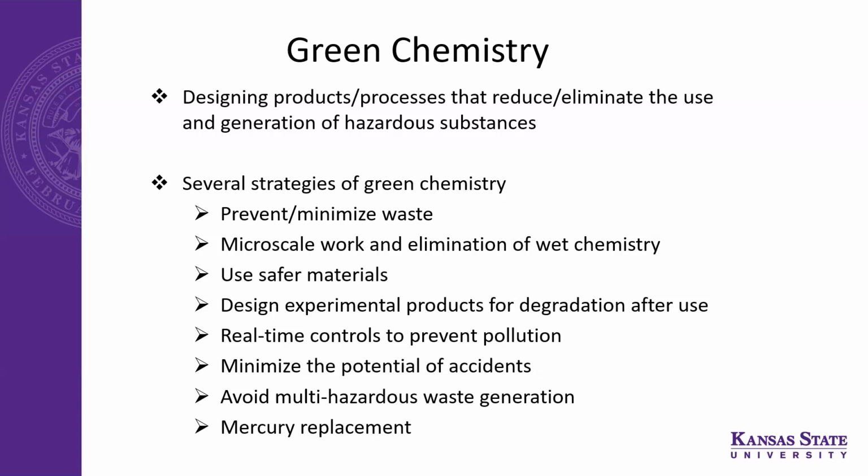Avoid multi-hazardous waste generation. So there can be steps which can be followed, for example, in a chemical synthesis, organic synthesis, there will be different routes that you can take to the end product. So that's what this means. Avoid multi-hazardous waste generation through different reaction pathways, if possible.